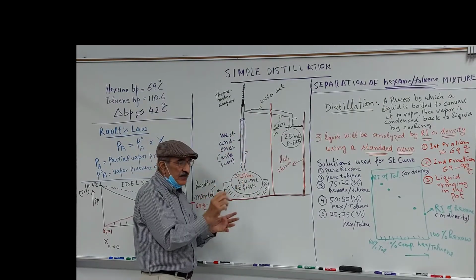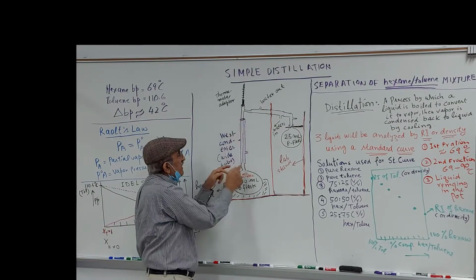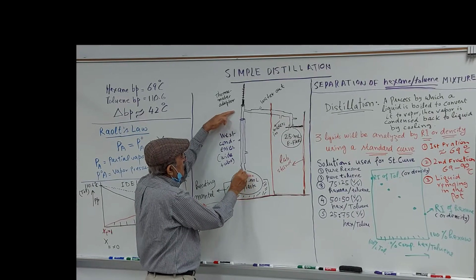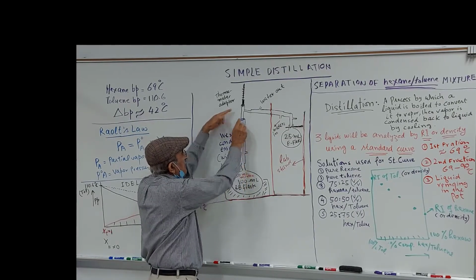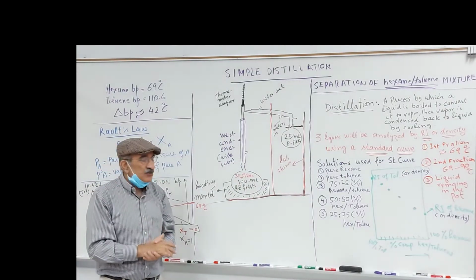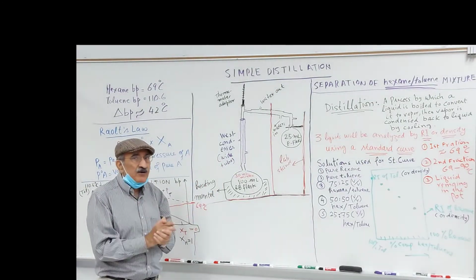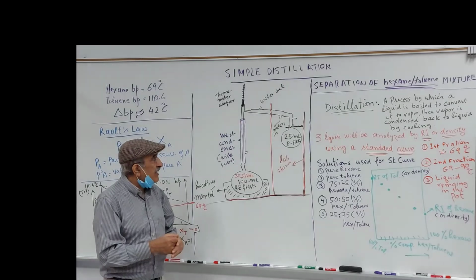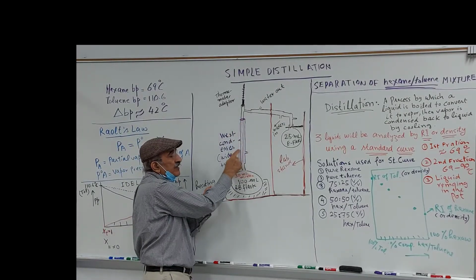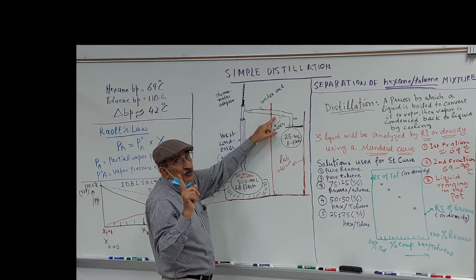You interpose it to make the distance longer. So when you boil the mixture, the vapor will have to travel a long distance, and the longer the distance, the better chance of separation. So that was my idea, and when I did it, it turned out to be much better actually. So I asked my students to interpose another column here, a dry column, no water running through it. Now you'll be using another condenser here, so you'll be using both condensers today.